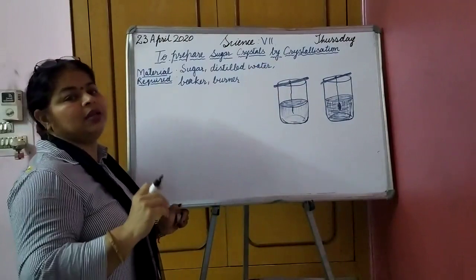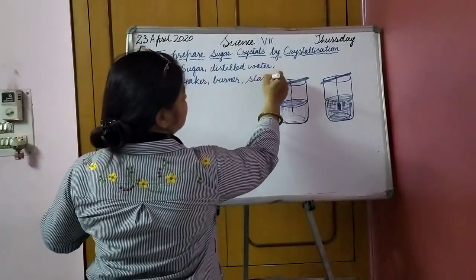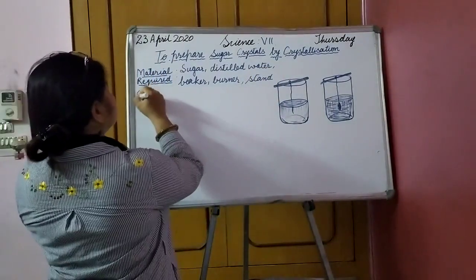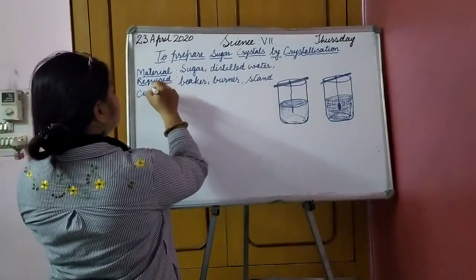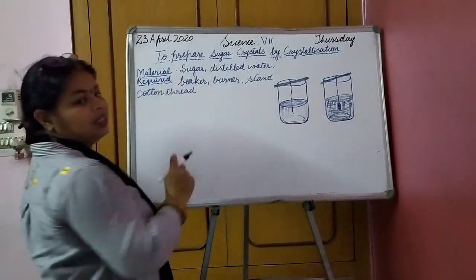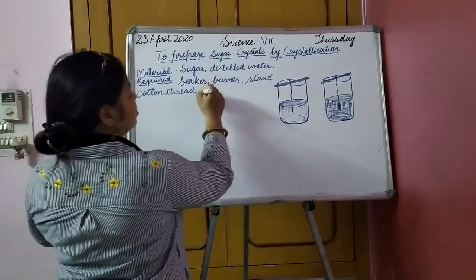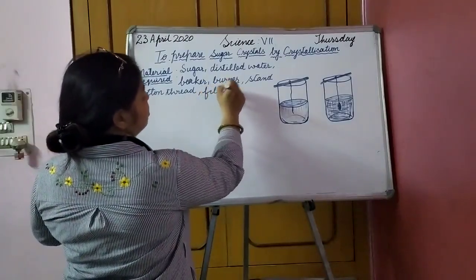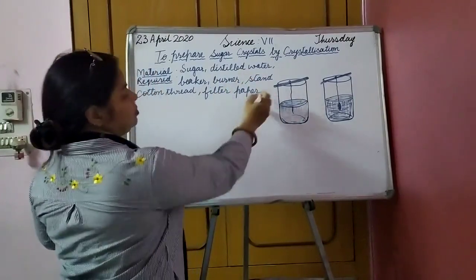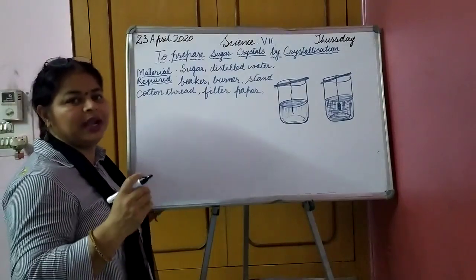Then some stand, a cotton thread, a filter paper. What else is required?